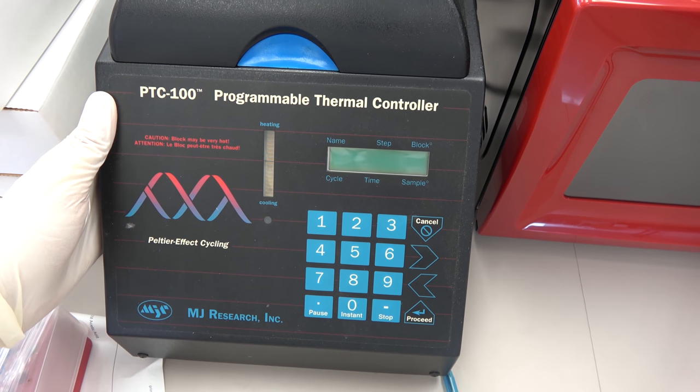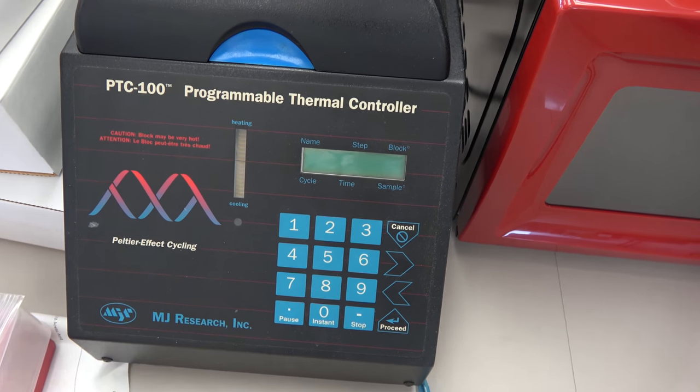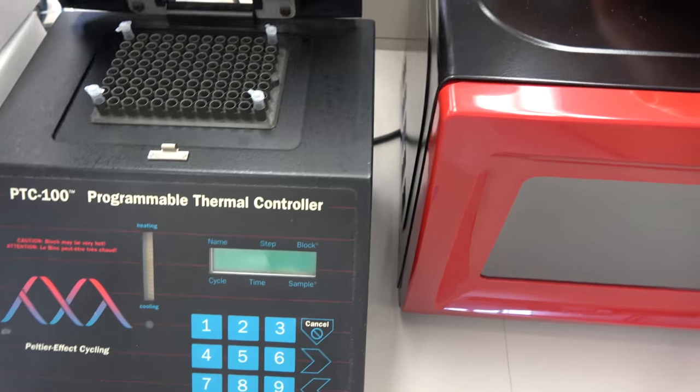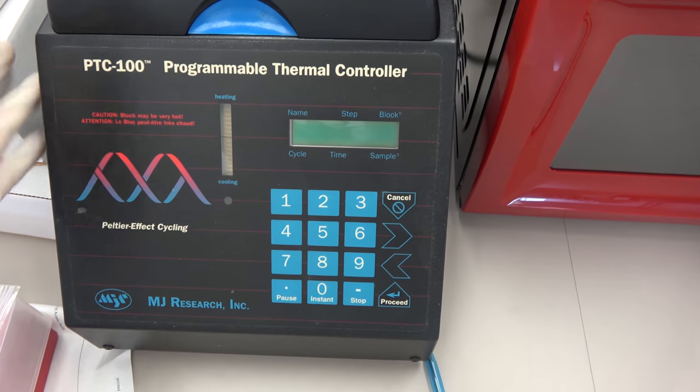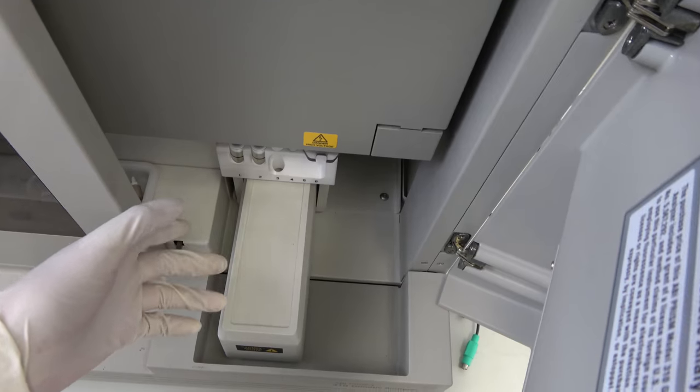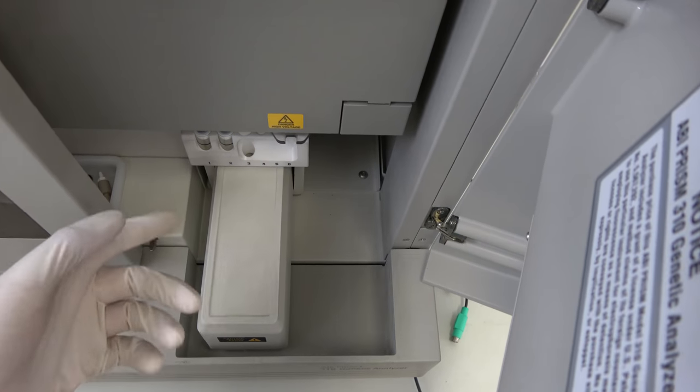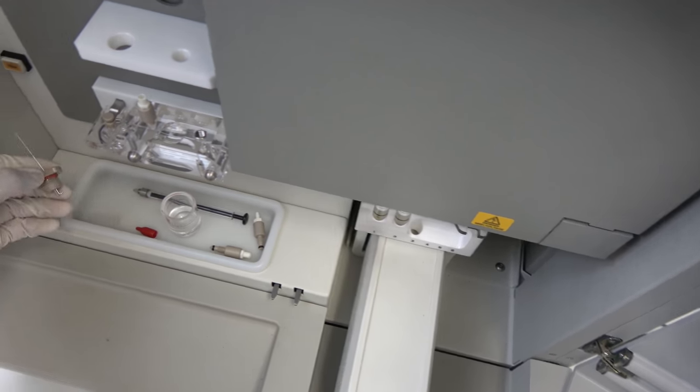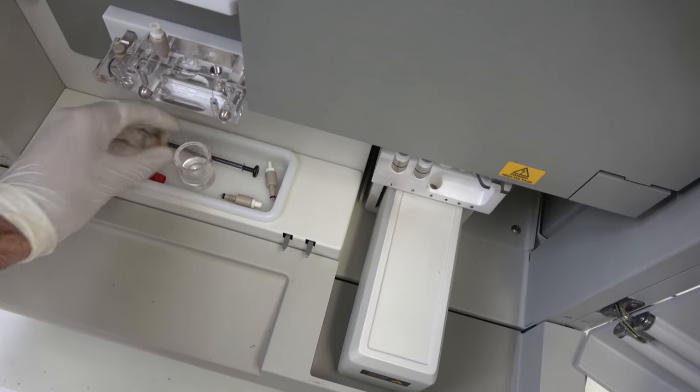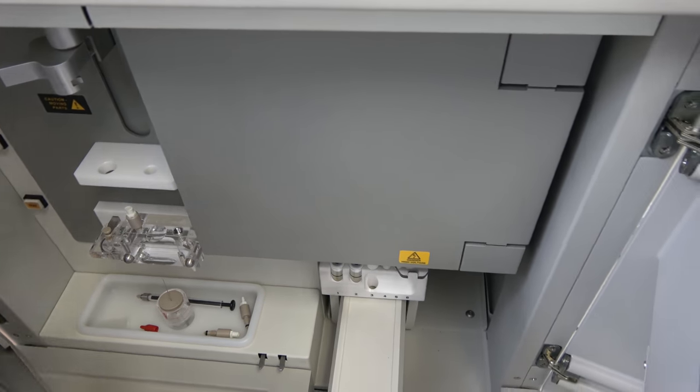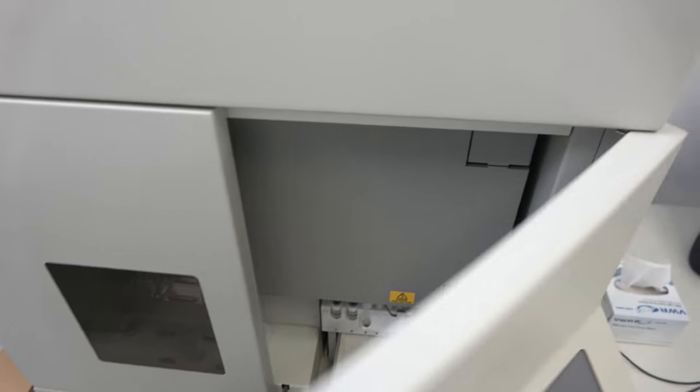This is a thermocycler. You put DNA samples in here to heat them up and cool them down. I'll go into that in a whole other video. So don't worry about that. But that's what a thermocycler looks like. See something cool? This is a genetic sequencer. I felt fucking sexy saying that. This, you just you put things in here like DNA. Yeah you put DNA in here and it does things. It basically shows you the DNA sequence. It prints it out and it you know plug it in. It's like it's there. It's done. It's science.